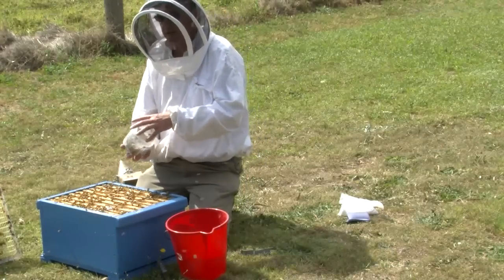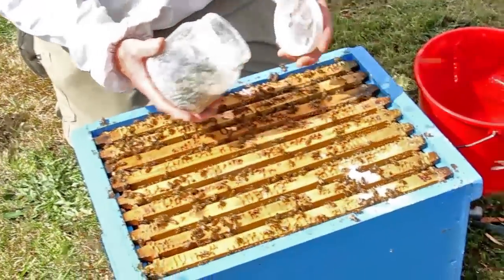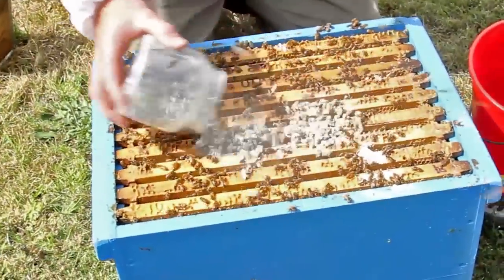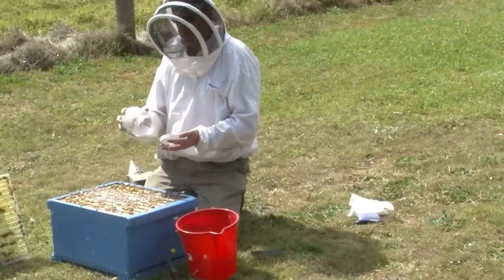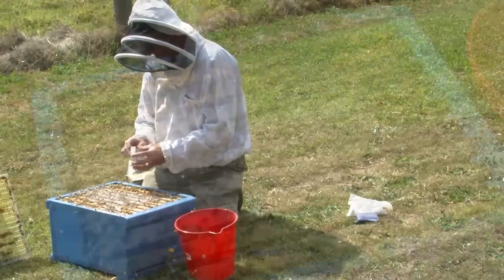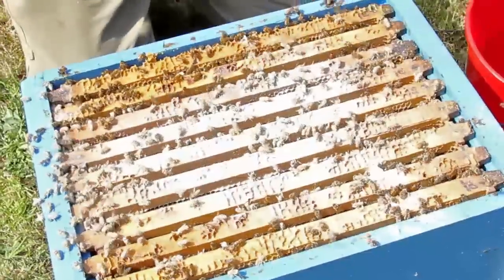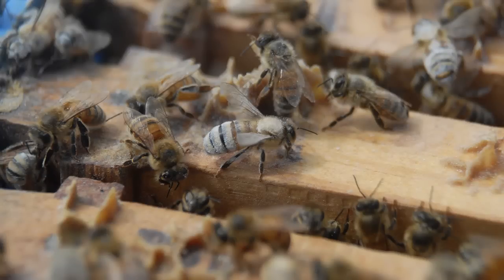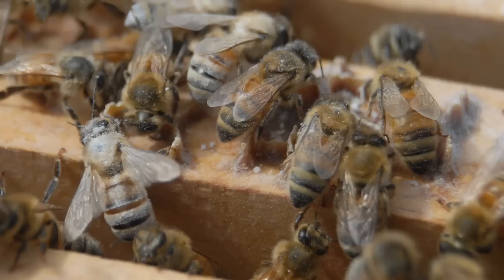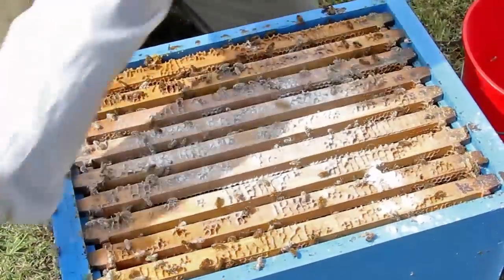Based on how many mites we find, it determines whether we go ahead with a treatment or not — or in this case, whether we've got mites in Australia. Now I've finished with the bees. I do like this technique compared to others because it's non-destructive to the bees. I can release the bees back into the hive, and the other bees will clean the sugar powder off them — they'll be quite clean and active members of the hive by this afternoon. It's a very simple and efficient means of monitoring mite levels in a beehive. I'll just give a bit of smoke, push them down, and put the hive back together again.